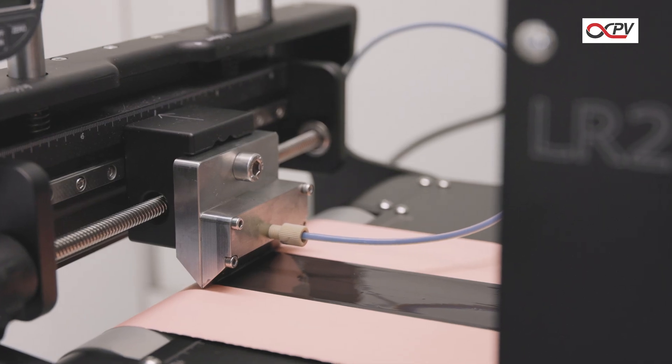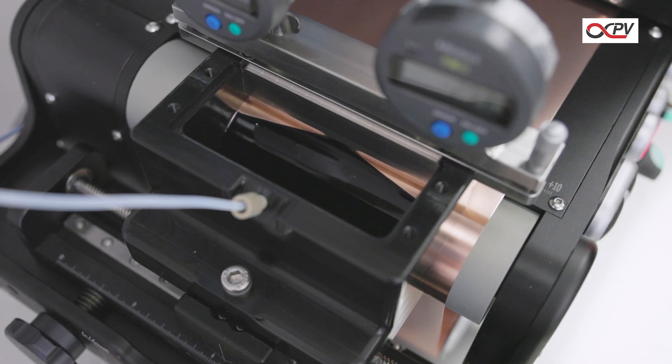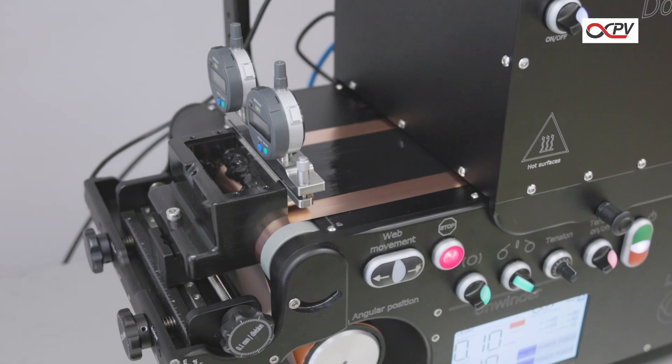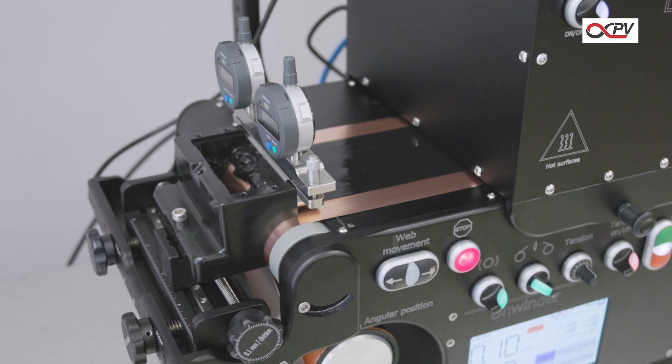In contrast to slot die coating, the inherent movement of the roller serves to agitate the ink, which is often crucial for suspensions and inks with large particles and aggregates.